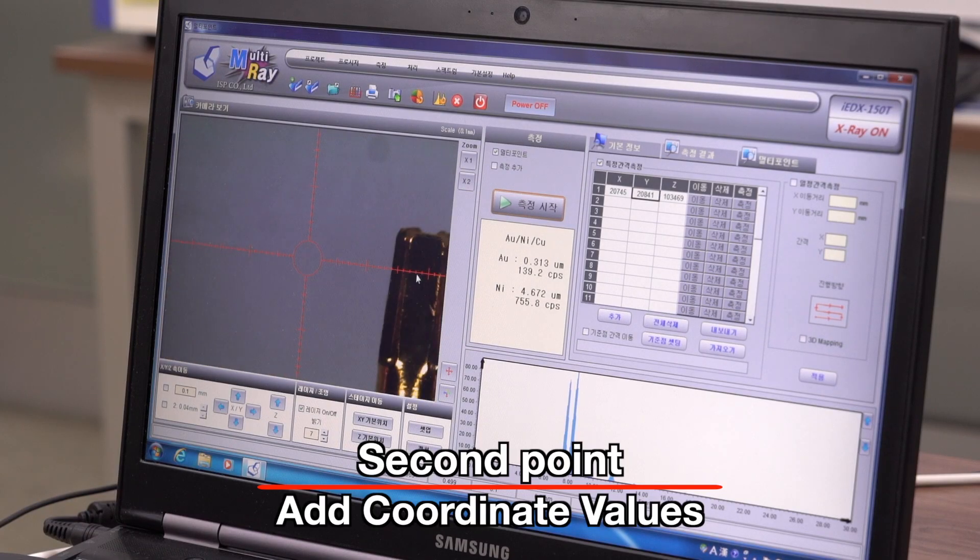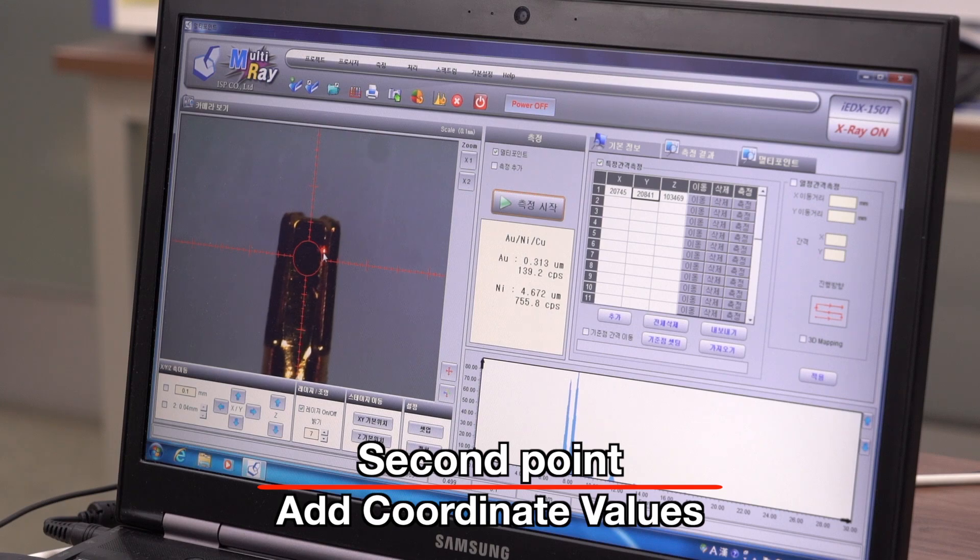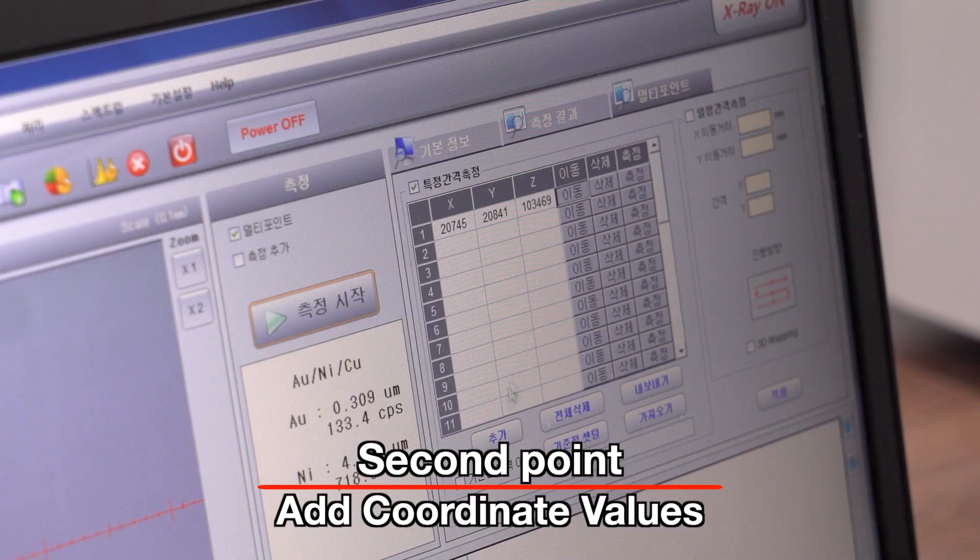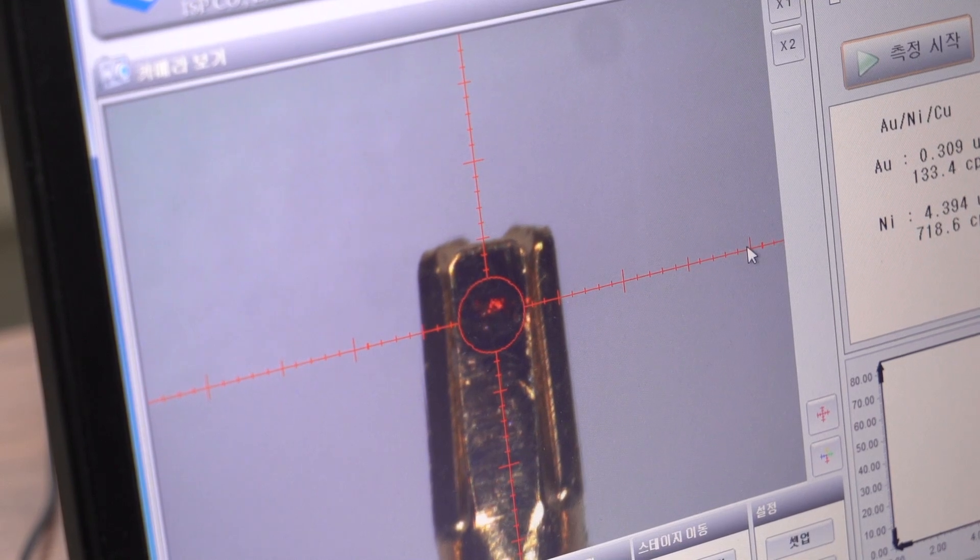Move to the next location. Move the location and press the add button. Move to the next position.